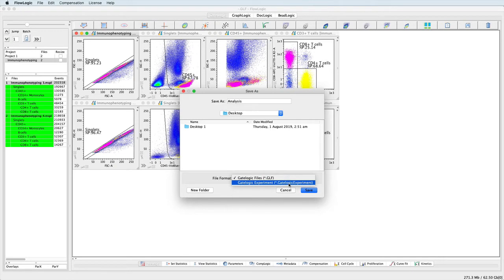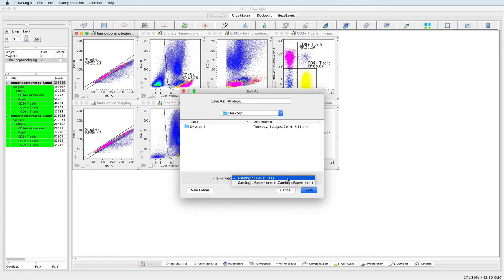A .glf will create a link and record the location of the saved FCS files, whether that be on the computer or on an external drive. If these files are moved, then the next time the GLF is opened, FlowLogic will ask you to locate the files.